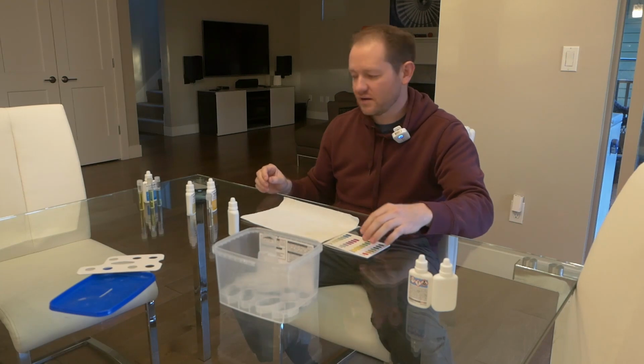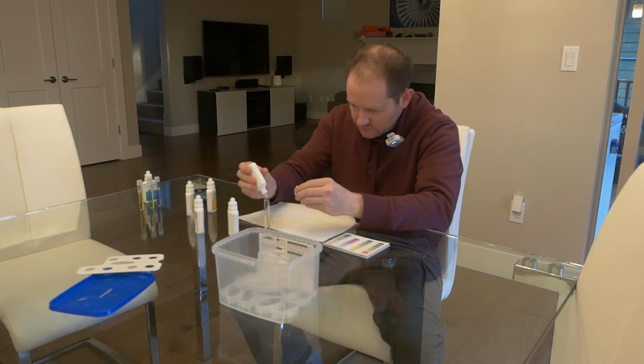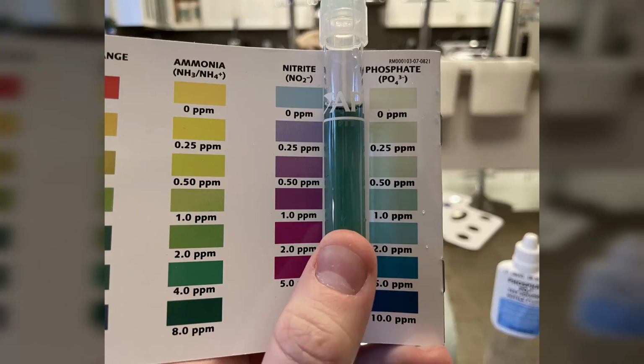And next we'll test out our phosphate here. 6 drops here. And on that phosphate, we're looking somewhere between 1 and 2 parts per million.